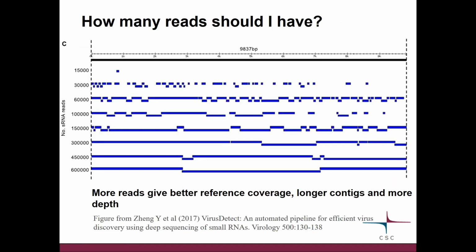One question that you might wonder is how many reads should you have? When you order sequencing of your samples, how many reads do you want? Because of course the more you ask, the more you pay. Typically you get away with quite a small amount, but of course the more reads you have, the better reference coverage you get and the longer contigs you get.